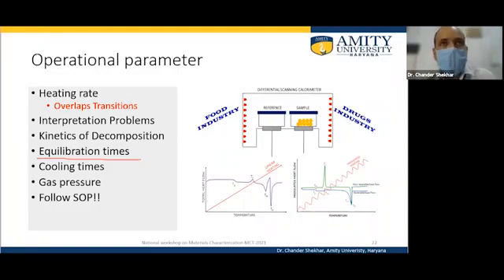So equilibration is very important, and generally half an hour to 45 minutes is required for the initial equilibration each day. If water is used as a coolant, then cooling time becomes important, because it takes more than the specified time, since the cooling liquid is generally not at 5 degrees centigrade.